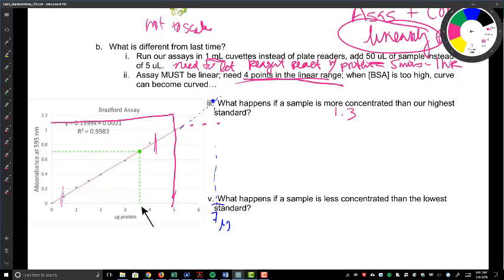So you're going to be going through your samples, and you may decide that you're going to add a particular amount of your BSA, a particular amount of your pooled samples, and you're inevitably going to run into a situation where you're going to get an absorbance that's higher than your highest standard, your highest BSA standard. If this happens, stop. Don't keep going, and don't give me attitude if you go all the way through and half of your samples are above the highest concentration, because you have to go back and adjust your sample so it's within the linear range.